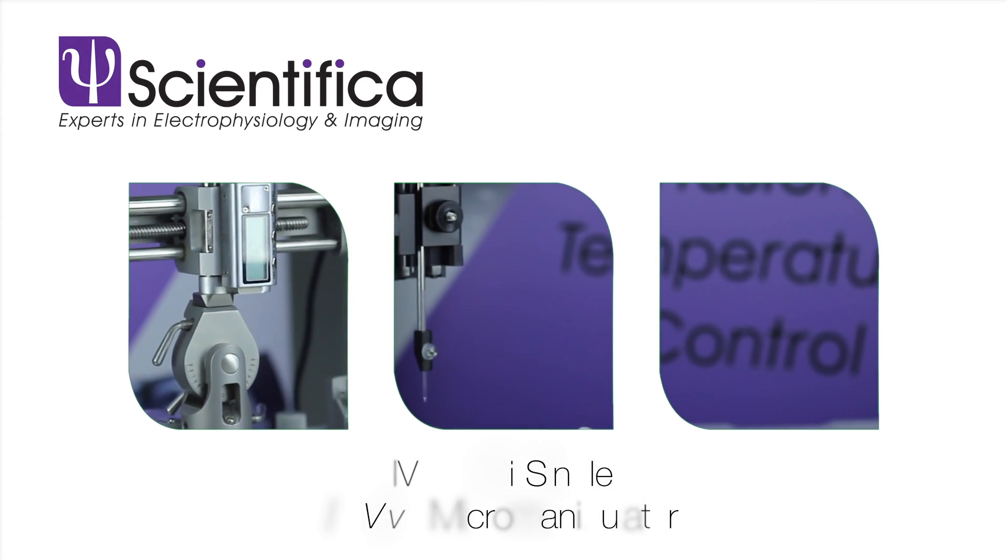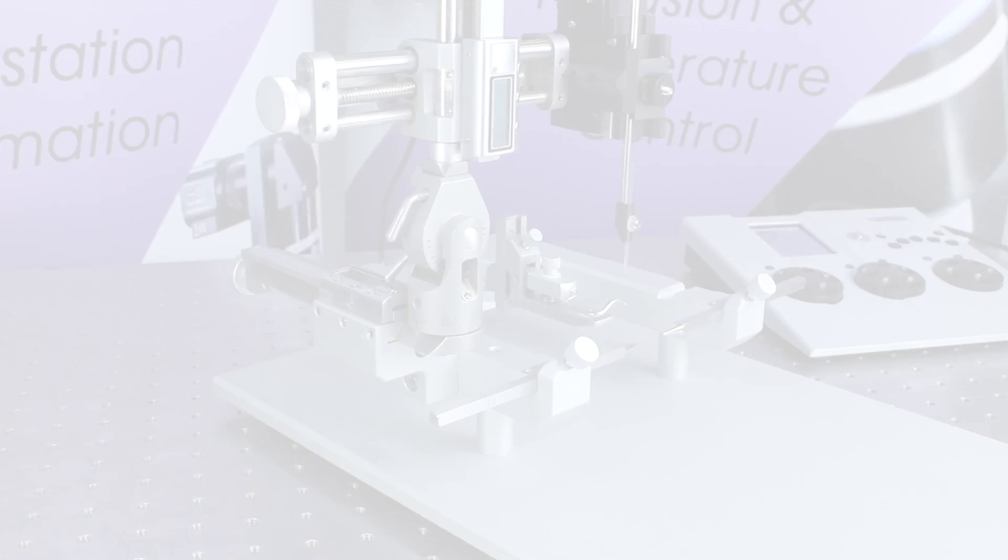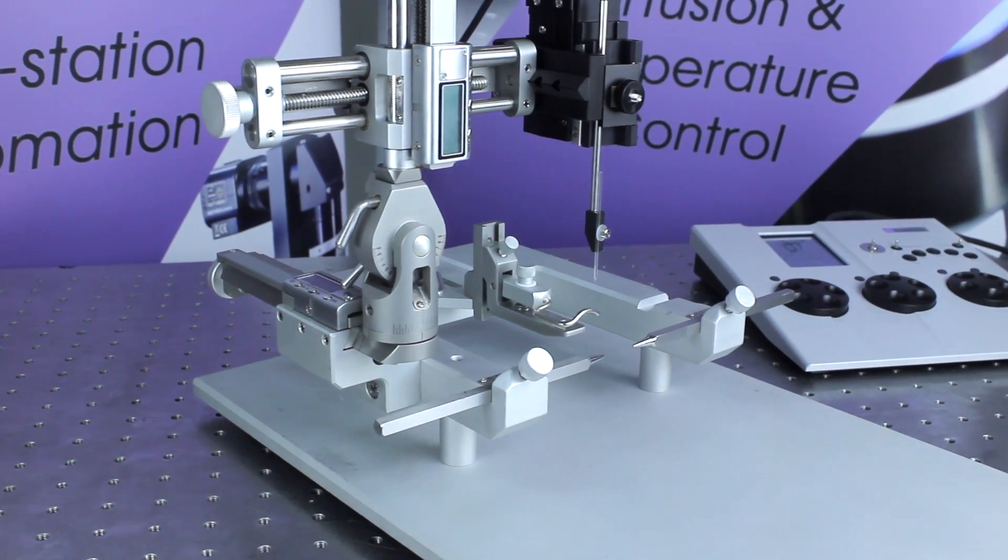Scientifica's IVM Mini Single is a versatile micromanipulator for demanding in vivo applications, particularly where space is limited.